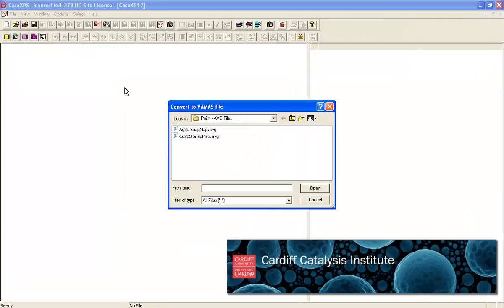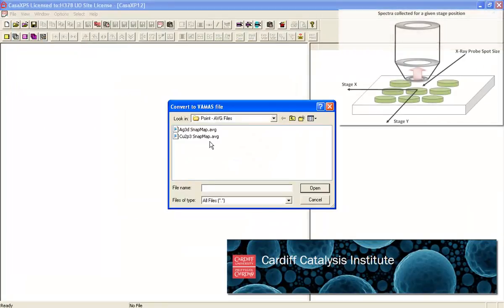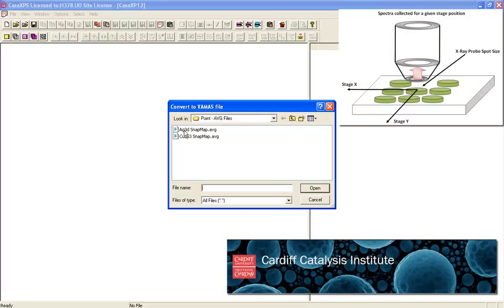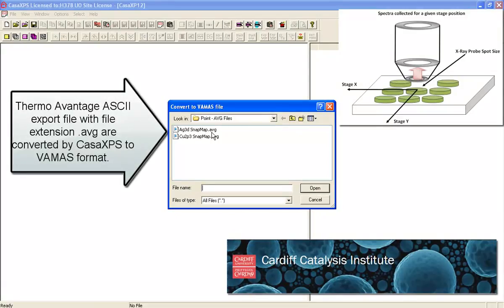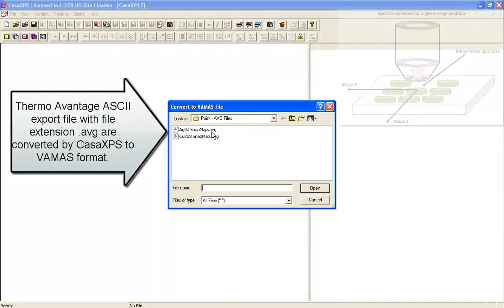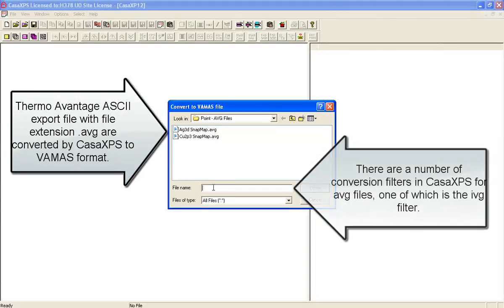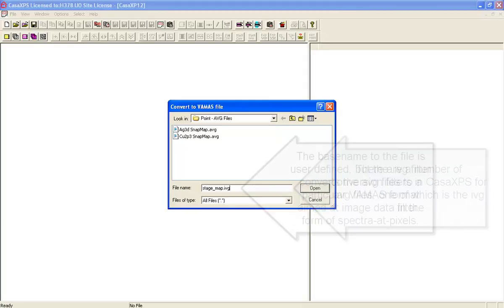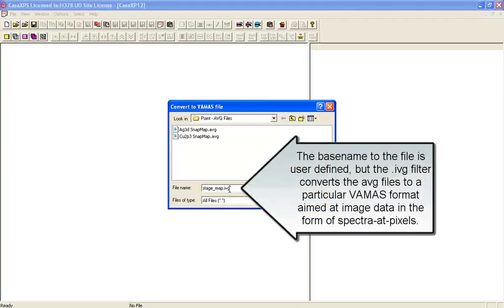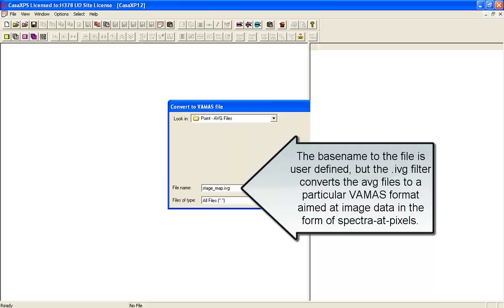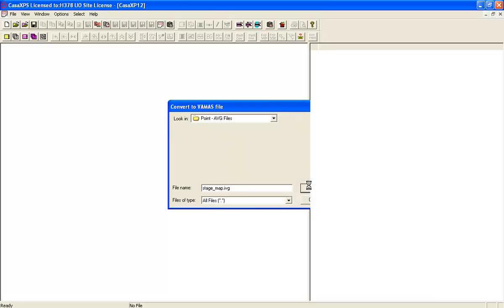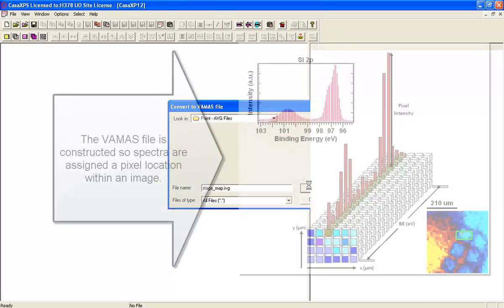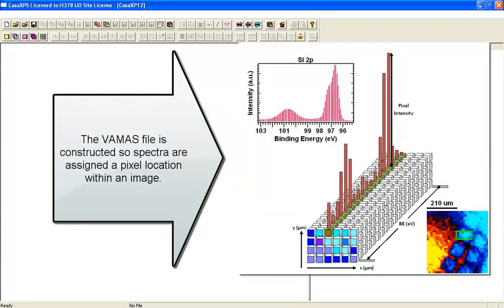In this example, a stage map that has been collected by a thermo system has had the data converted into AVG format. CASA will be able to convert these as a stage map if we use the IVG file extension. This is the filter that will cause the conversion from the AVG files into a VAMAS file that will be organized as an image dataset.